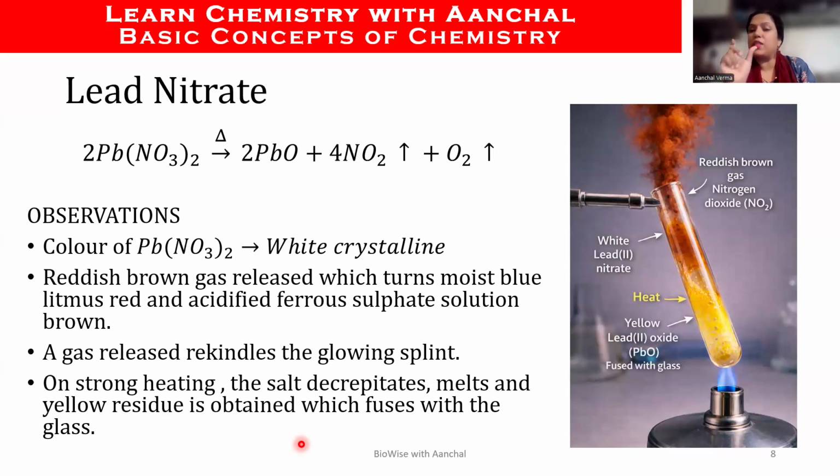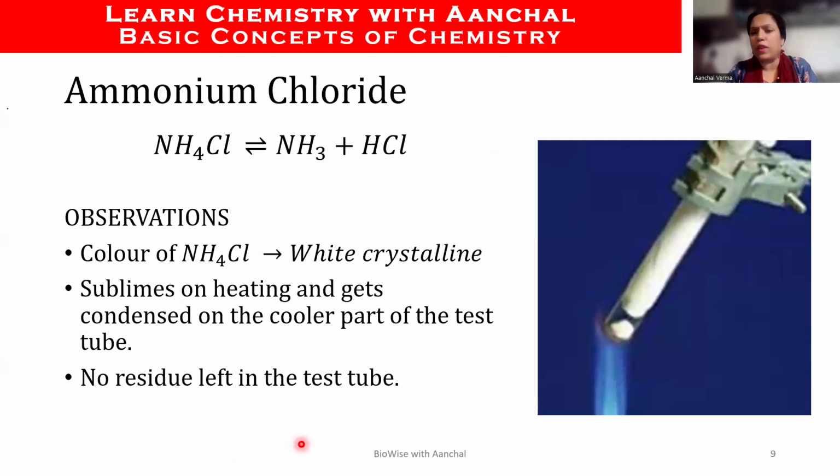Now, there is a specific name for these heating reactions. You know what? These are all decompositions. So, since heat is involved, it is thermal decomposition reactions. Moving to the next, ammonium chloride. Now, ammonium chloride is a sublimable substance.